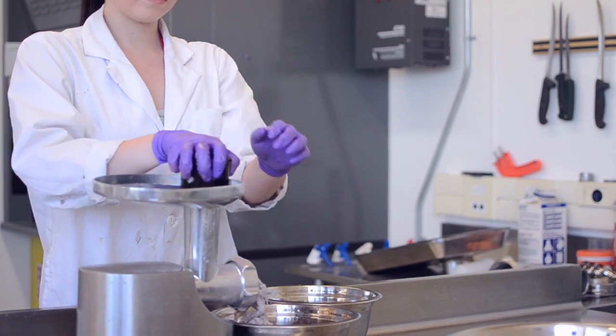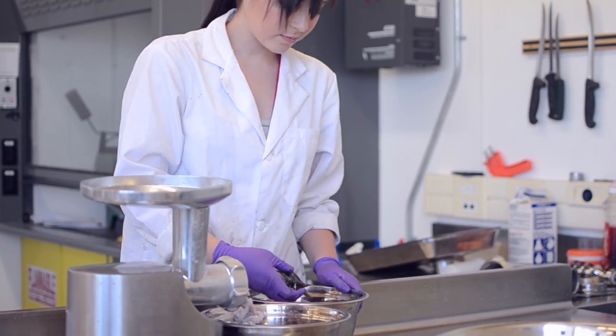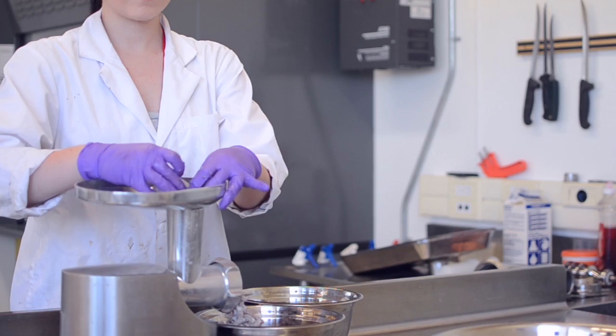Once our fish have been ground and a homogenate sub-sample taken and frozen, it goes through further processing to gather the data we need. First, the sample will be freeze-dried for up to a week to remove all moisture. Then it will be ground to a fine powder in a ball mill.